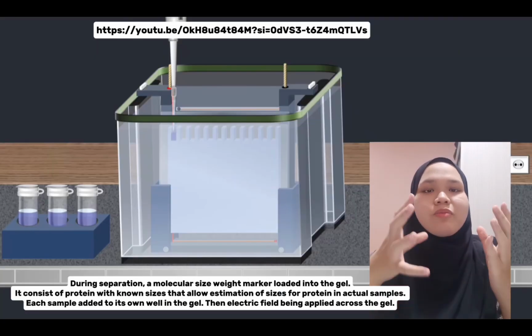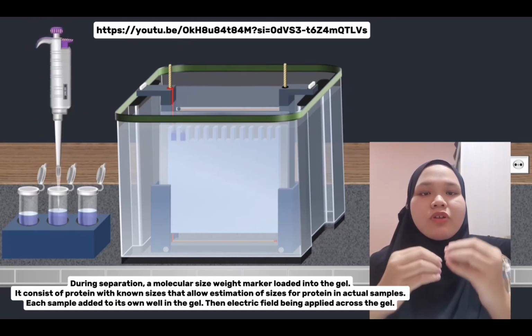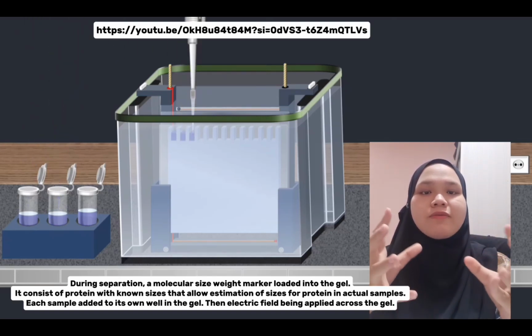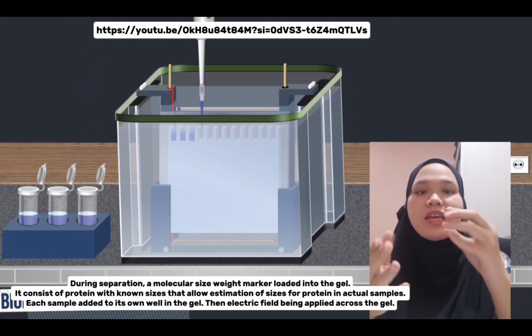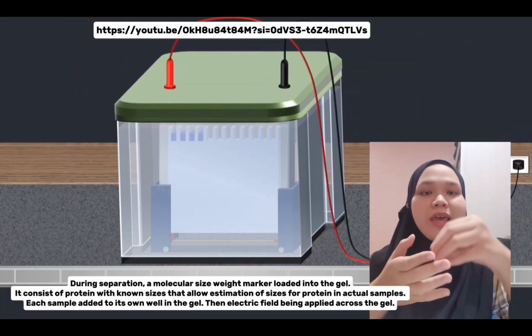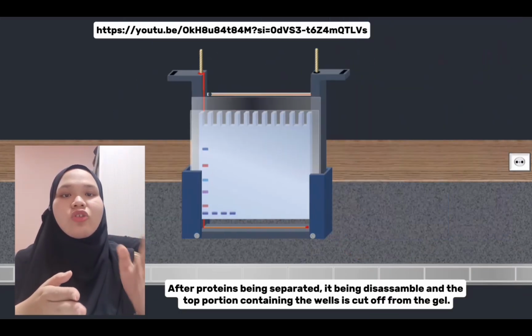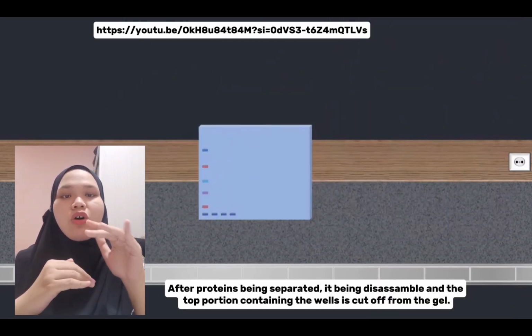During separation, a molecular weight size marker is loaded into the gel. It consists of proteins with known size that allow estimation of sizes for proteins in actual samples. Each sample is added to its own well in the gel. Then, an electric field is applied across the gel. After the proteins are separated, the gel is disassembled and the top portion containing the wells is cut off.